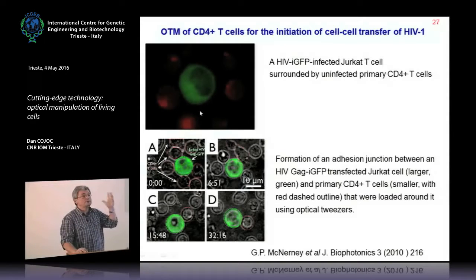Here you already see multiple optical traps. And you might wonder how you obtain multiple optical traps. You can obtain them by shaping the trapping laser beam, as Matthew said, with a video projector-like device. It's a spatial light modulator. With this device, instead of getting one trap, you obtain multiple traps, splitting the input beam into different beams that you can configure spatially in a dynamic way.